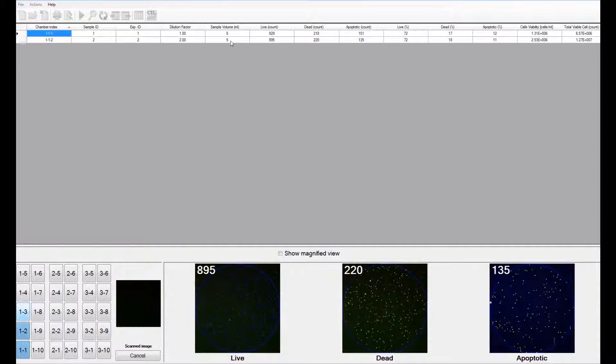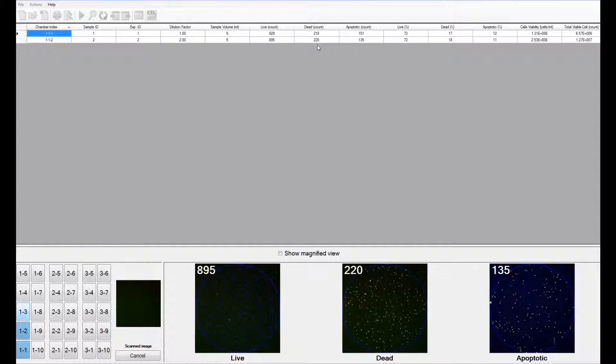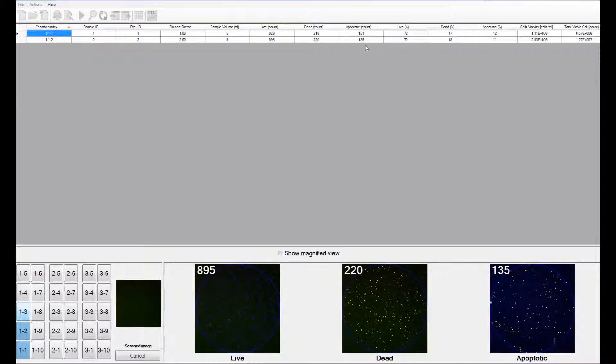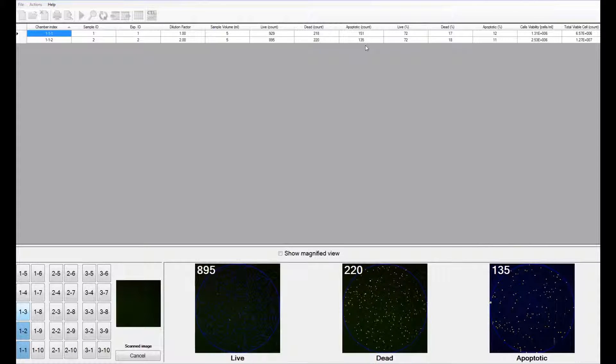The dilution factor is what you had entered. The sample volume is what you had entered. The live count, the dead count, and apoptotic count is scanned, counted, and analyzed by the software.